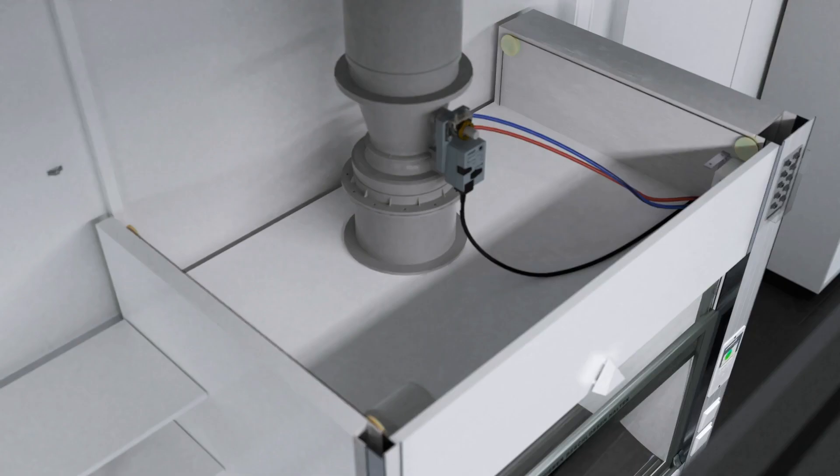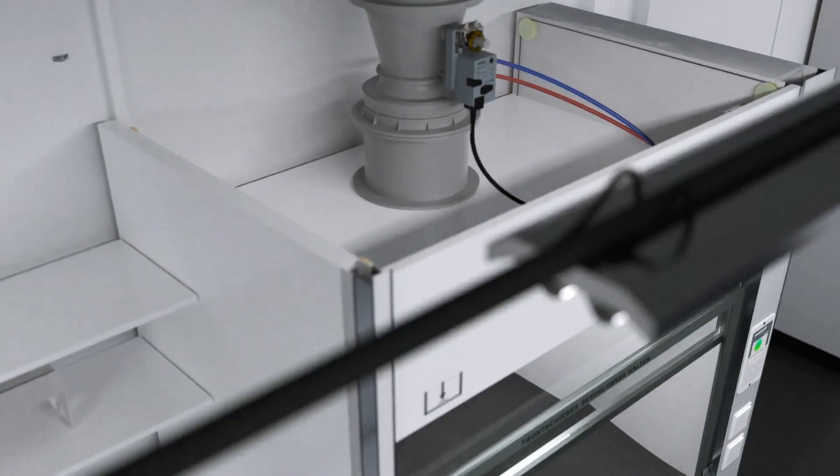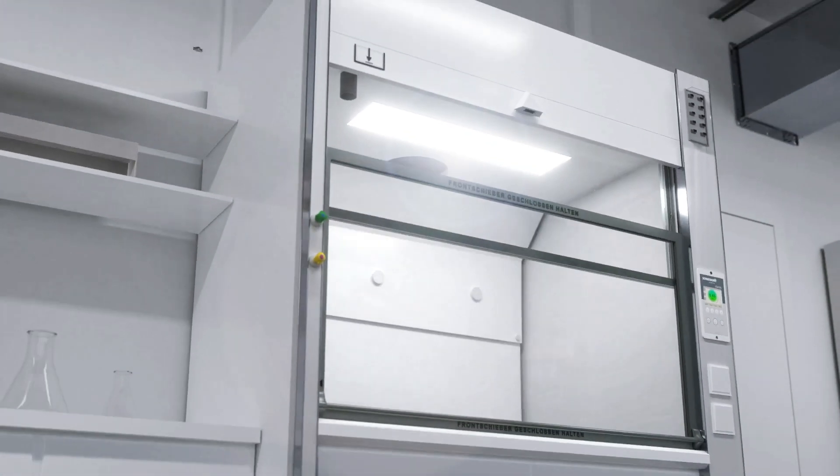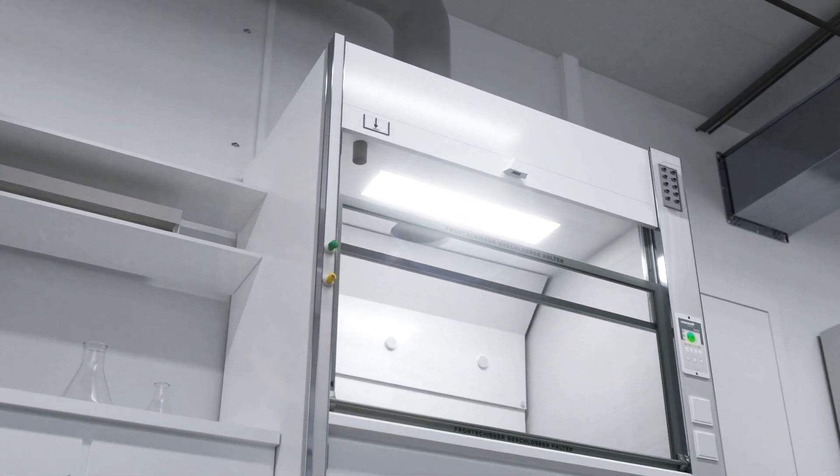A fast actuator is able to control the air velocity in case the front sash is lifted, and its performance is verified for maximum safety.